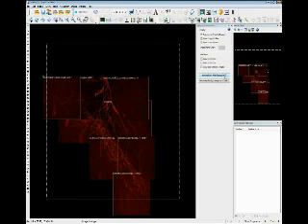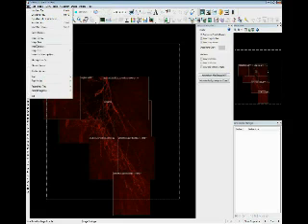It's also important to know that the data persists. After you align your stack, you can save it. You can either save it as one big file, one big JPX file, or you can save it in one of our data files, which will save the image stack positions or the image positions.